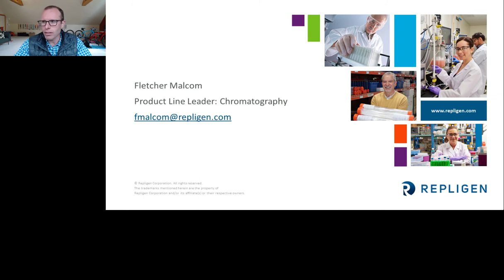Maybe they'll test or do some surveillance testing in a pilot or engineering setting, and then decide whether or not that needs to be incorporated from an incoming materials assessment for manufacturing. So we have seen many companies take the risk-based approach that no incoming qualification testing for chromatography needs to be done. We can simply use the results on the certificate of analysis.